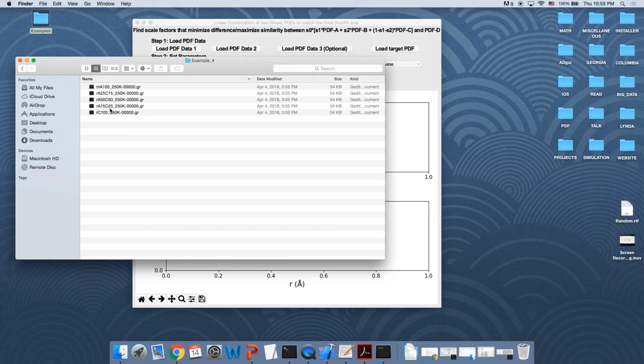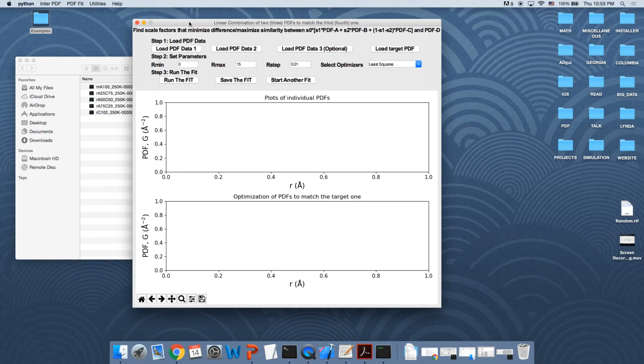Those 3 are the ASD, which you can think of as a physical mixture of the drug and the polymer, and we know the nominal concentration of that, 25, 50, 75 for different drug concentrations.